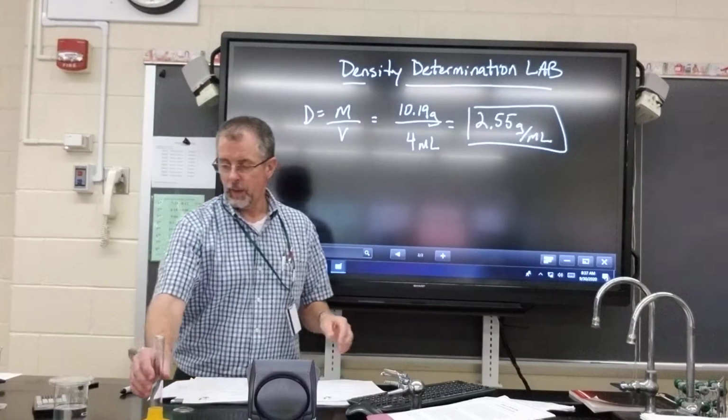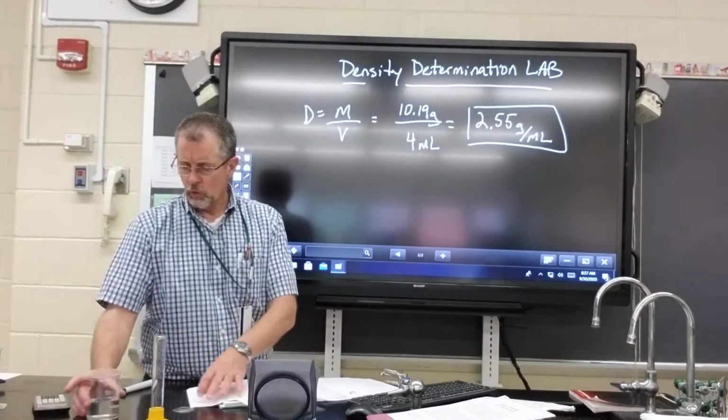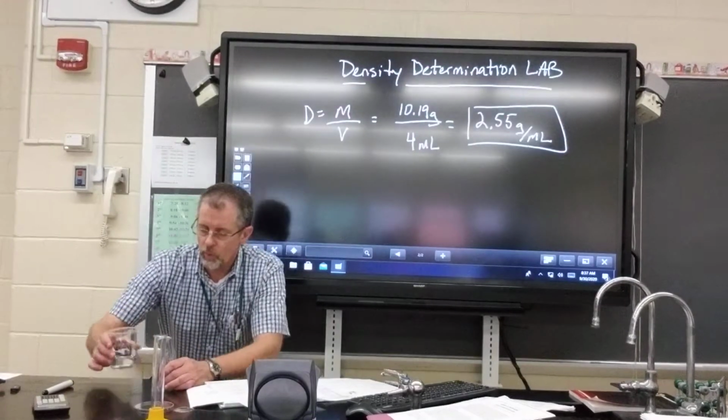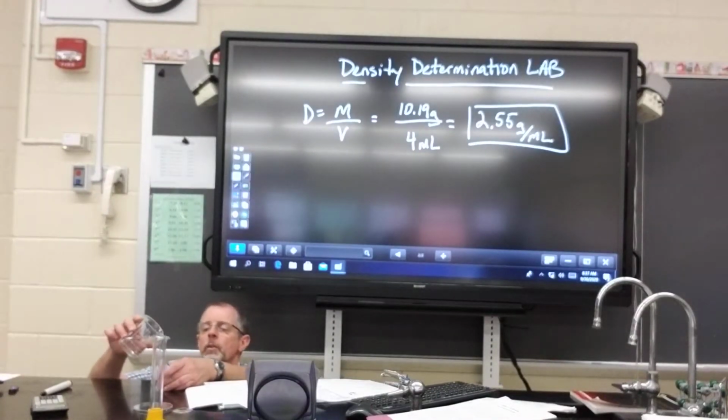Now we're going to start filling our liquid. So I'm going to add 5 milliliters into the graduated cylinder.